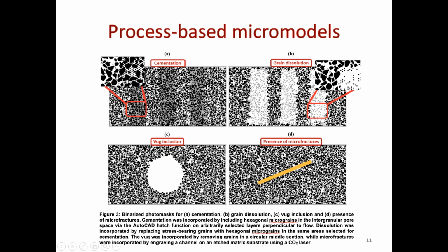You'll have a 3D version in whatever you're going to be processing for homework. Right? So in this image, from the internet, actually there is a bug inside. And he put a piece of plaster that he dissolved later.